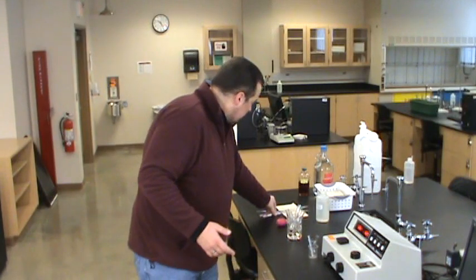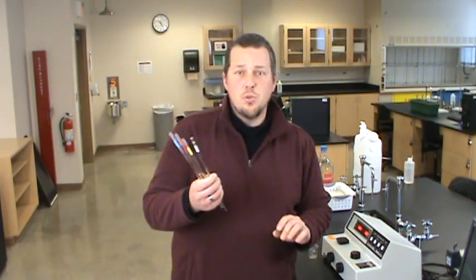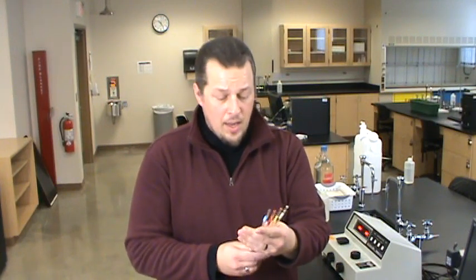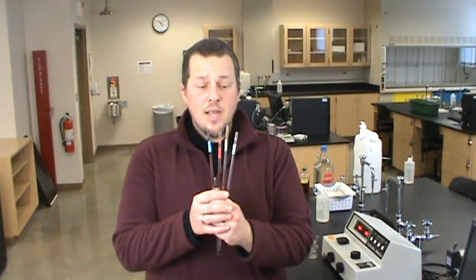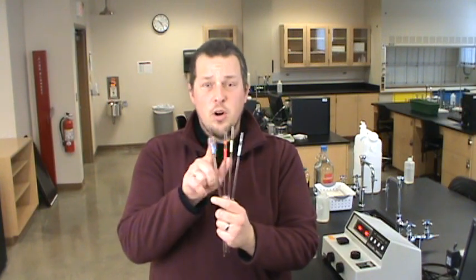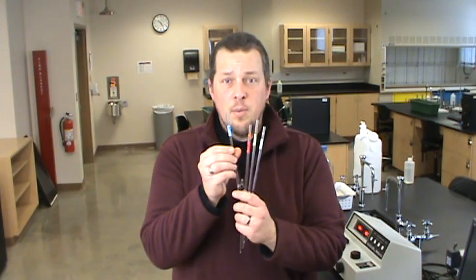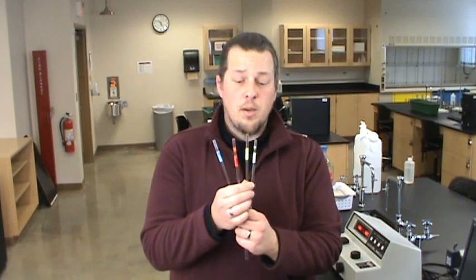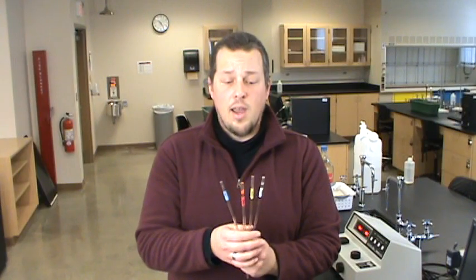Now we have to talk a little bit about how we're going to do the actual experiment. You're going to be making up your samples using pipettes. There are going to be some pipettes in the back of the room. To keep these things a little bit straightened out and to keep contamination from causing problems, the pipettes are all indexed with tape. There are four different colored tapes on the pipettes because we've got four different liquids we need to pipette: some labeled for HCl, some labeled ACE for acetone, some labeled iodine, and some labeled water. Make sure you keep those straight.